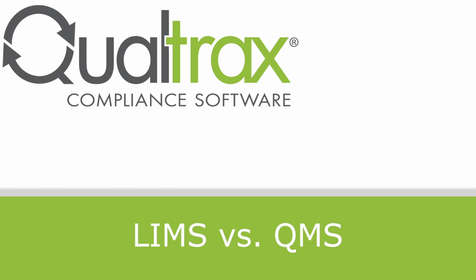LIMS enable you to not only track casework information, but also to report out data and statistics on that casework. This can be extremely helpful when grant funding is used to support a lab because you have to report those numbers back. This is also used for labs funded by the government since they have to report to legislators how many cases were worked in the previous year as compared to the current year, and how many in each discipline. Laboratories must remain competitive for jobs and must adhere to a quality or regulatory compliance on a local, state, and/or federal level to receive funding.